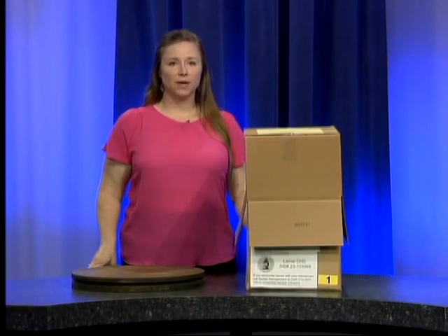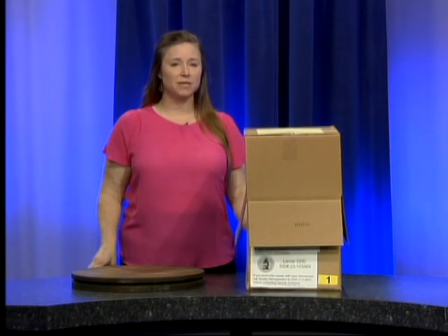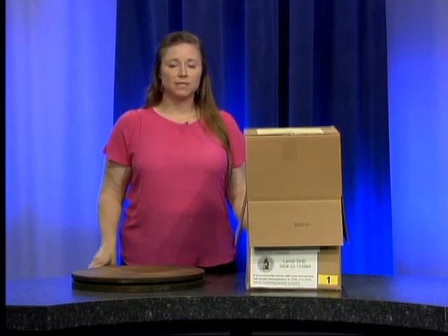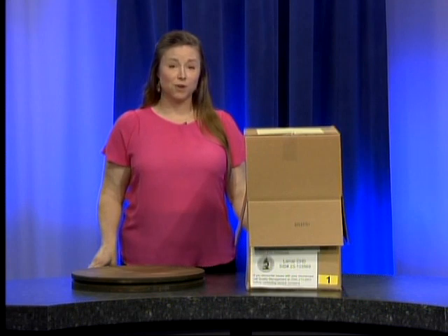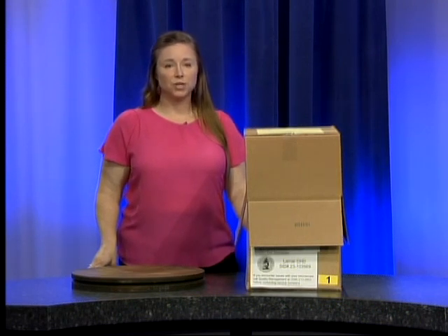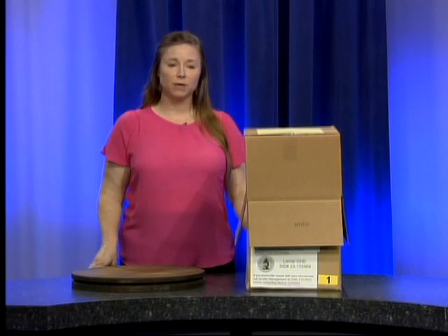Welcome to video one of four of our County Health Department Nikon Eclipse E100 Microscope Introduction Series. My name is Ashley Megalan and I'm a technical consultant for the Alabama County Health Department Laboratory System. In my visits to the County Health Departments I have long noticed that the microscopes are deteriorating, so it's been my hope that I would be able to do something about that one day. Last year I was able to procure a grant with help from the CDC that allowed us to purchase 95 new microscopes to replace the microscopes in all of the County Health Departments.